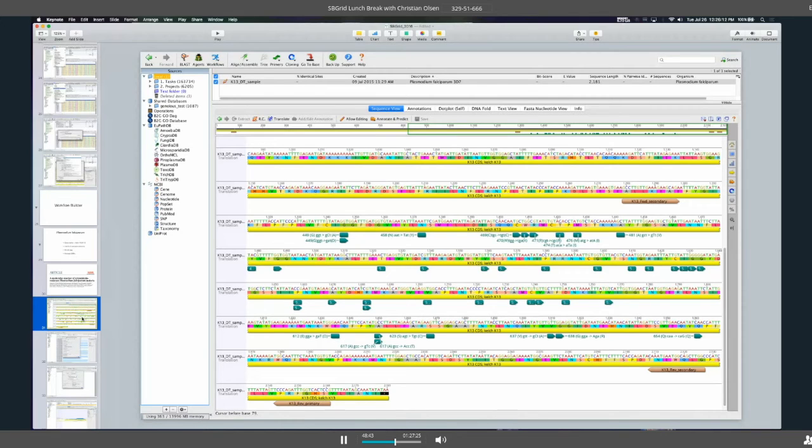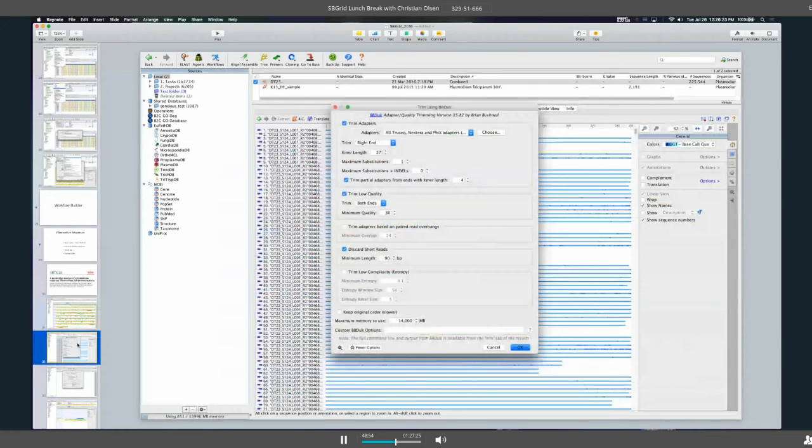Okay, so all of those green boxes are SNPs, as well as we've got a way that we named the SNP, which you can see next to some of the SNPs in green.